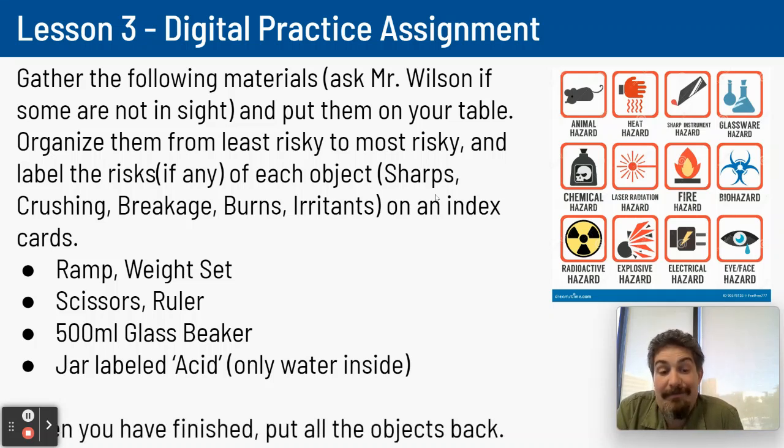And once you've finished doing this activity, put all the objects back. And I'll remind you again, be very careful. Do not break any of the glassware. Be very careful carrying these things. Okay, this is our first time working with these objects directly, and let's start strong and not have a problem. Good luck.